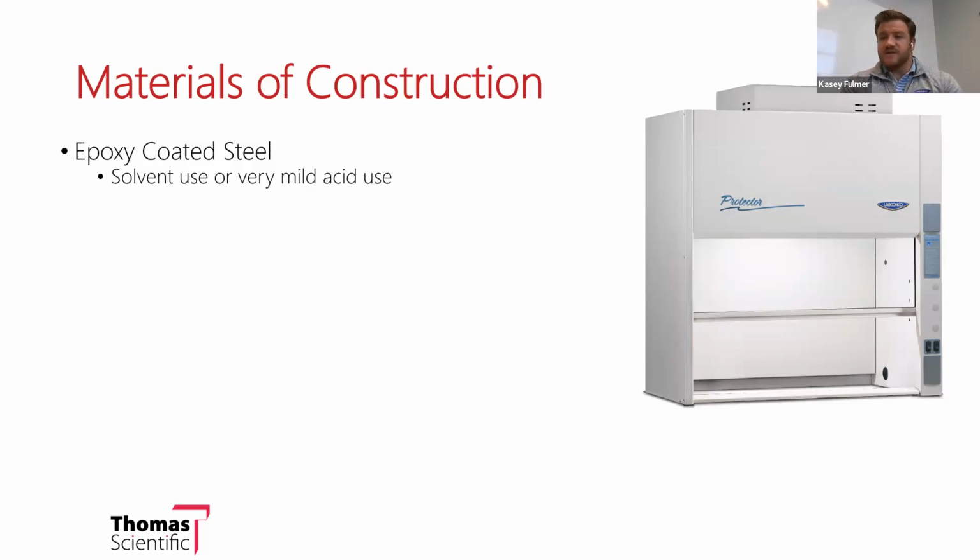So if you are using solvents or very mild acids, this might be a good option for you, because if you're using solvents, one of the more chemically resistant materials might be a little overkill and more expensive than you need in your hood. So the epoxy coated steel could be an option.